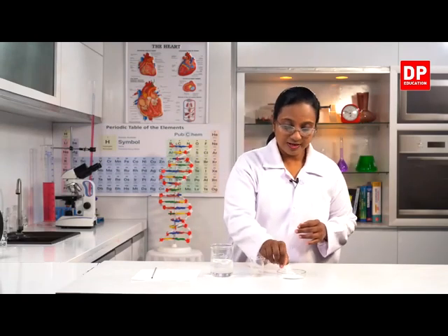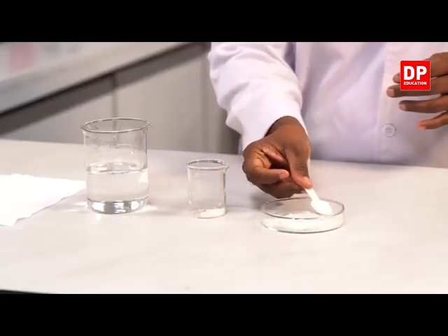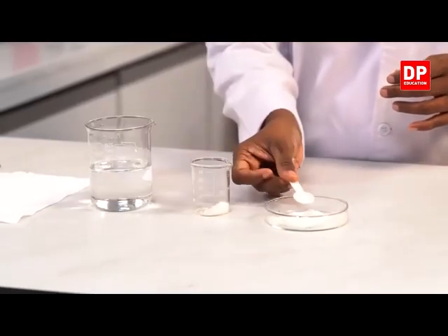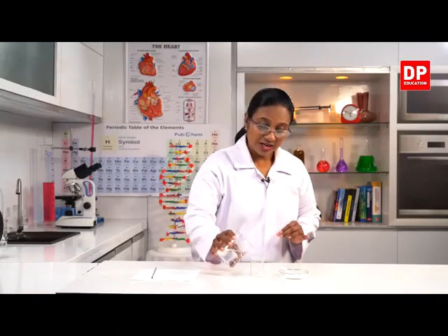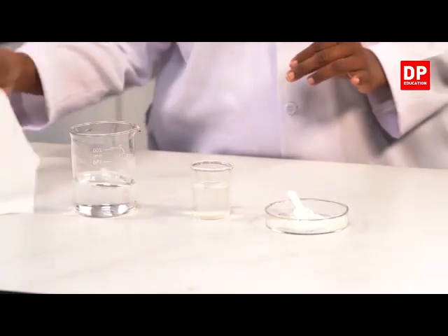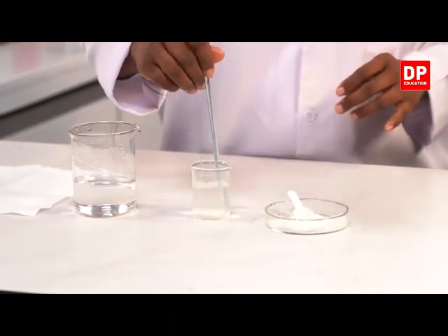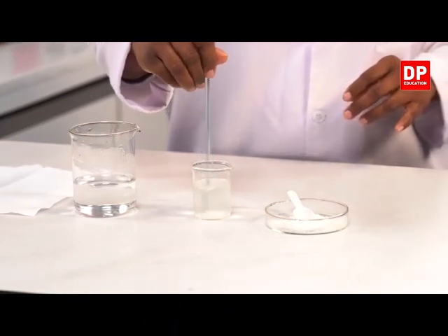Okay, students. So now we are going to observe the nature of homogeneous mixtures. To do that, I have salt here. I will transfer some salt. It has to be 2 grams, but since this is going to be a qualitative activity, I'm just taking a yogurt spoonful of salt, and to that we need to add some water and dissolve it well. You all know that salt dissolves well in water.